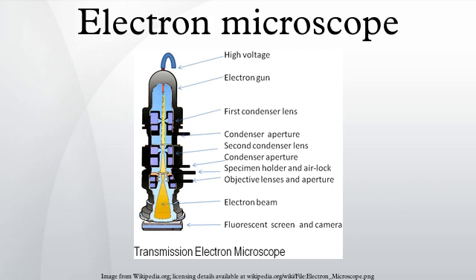Moreover, Reinhold Rudenberg, the scientific director of Siemens-Schuckert Werke, obtained the patent for the electron microscope in May 1931. In 1932, Ernst Lubcke of Siemens and Halske built and obtained images from a prototype electron microscope, applying concepts described in the Rudenberg patent applications. Five years later, the firm financed the work of Ernst Ruska and Bodo von Borries, and employed Helmut Ruska to develop applications for the microscope, especially with biological specimens.